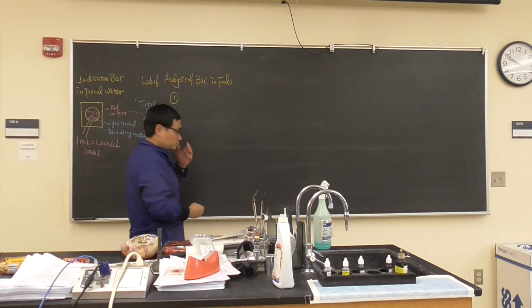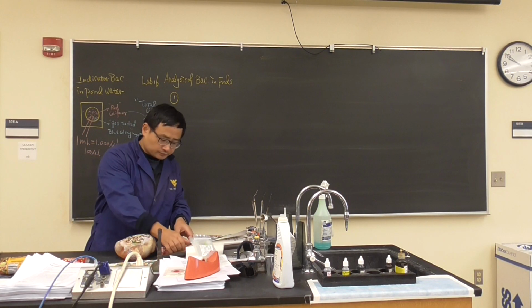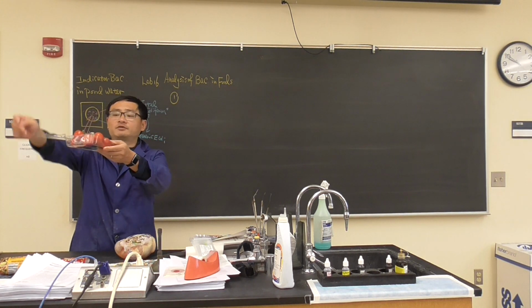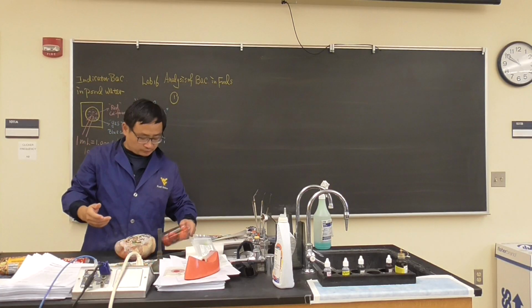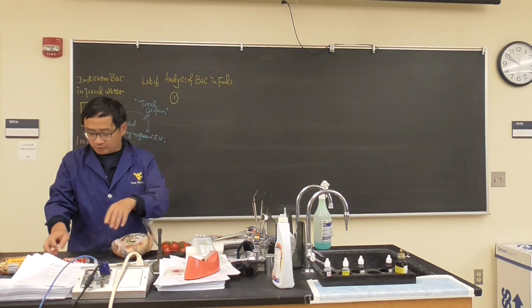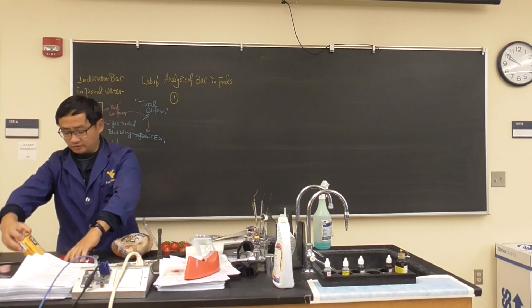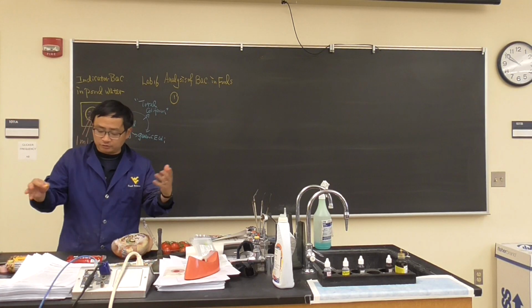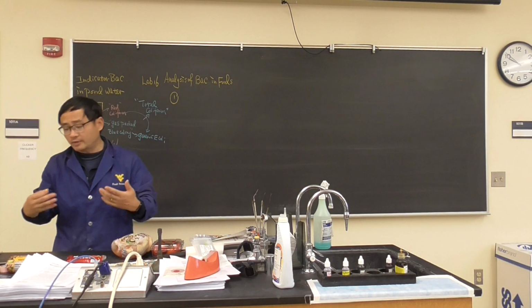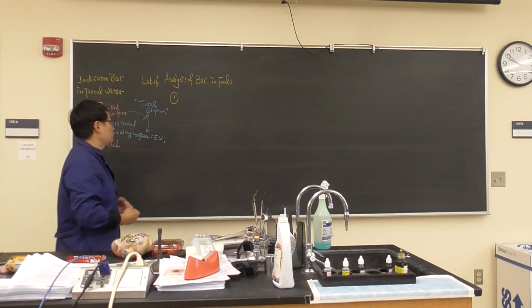So first of all, let's talk about all these different products. We got a cherry tomato, which comes from a greenhouse. I think it's very small. We got a chicken, a bird's carcass. We get hot dog, and we get ground beef. So we're going to go through the process of how we do the analysis. What we are here to do is a general total microorganism count. It's not specific for pathogens because we are not allowed to isolate pathogens.